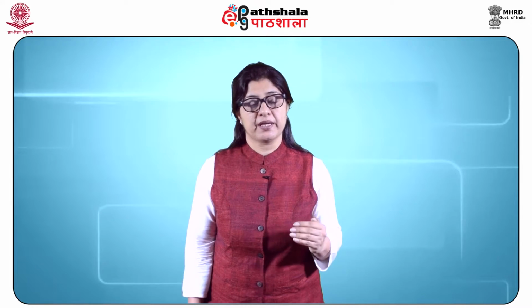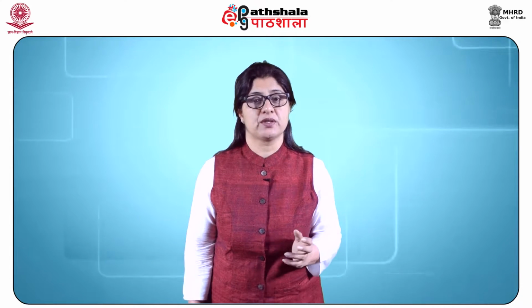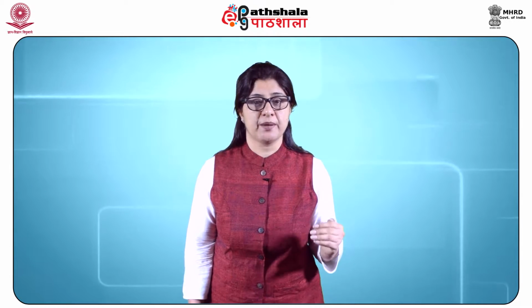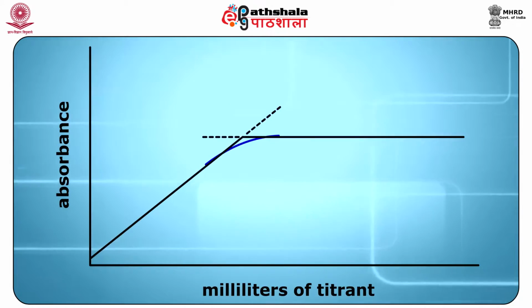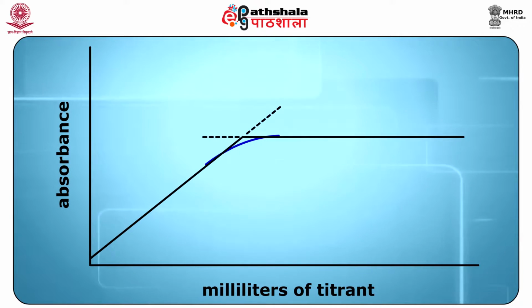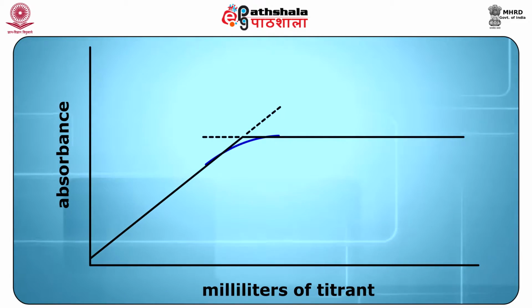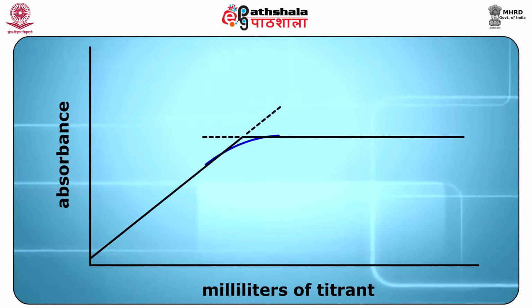Endpoint detection by the use of UV visible spectroscopy introduces objectivity into the analysis and lends itself to automation. In photometric titrations, a spectrophotometer is used to detect the endpoints graphically. The absorbance of a titrated species is measured after each addition of a titrant until the endpoint is well passed. A plot of absorbance versus milliliters of the titrant consists of two straight lines that intersect at the endpoint of the titration. This method is called the mole ratio method.